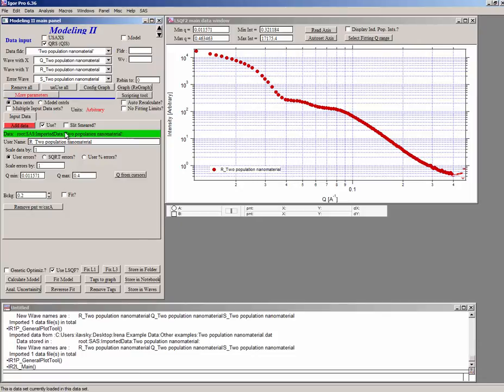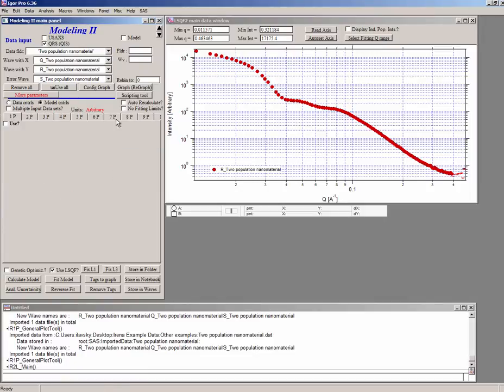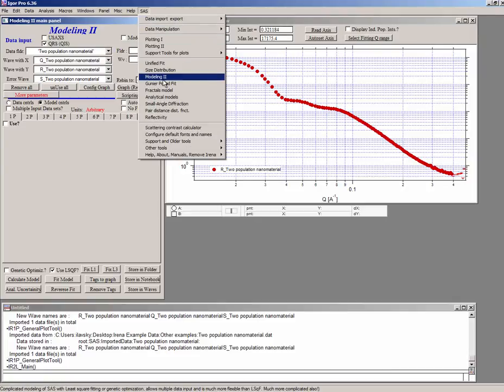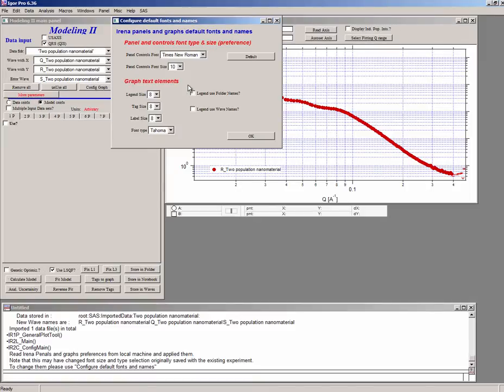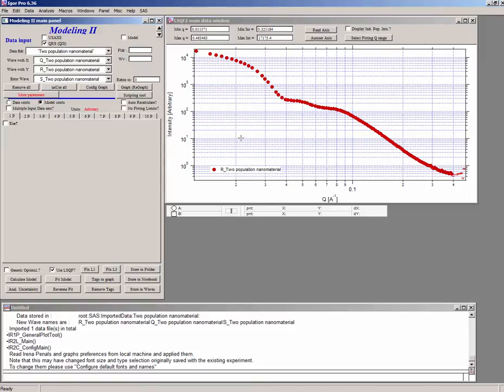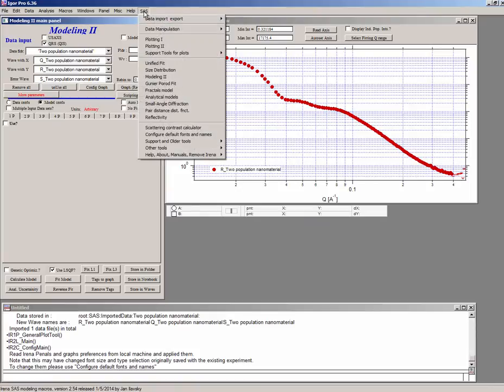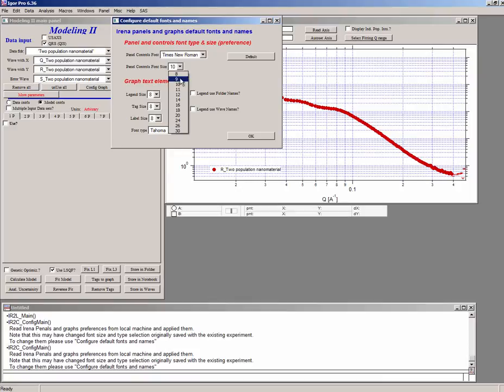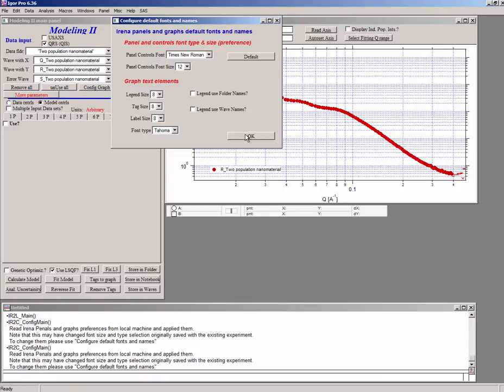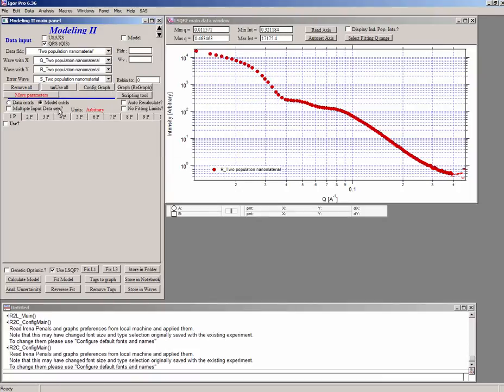Now we can go and build a model. So we're going to go and click on the model controls. Here's 10 populations. And if you don't see all of them, you can do the same thing. Configure default fonts and make the font smaller. If we make it smaller, you now see all 10 tabs. But for you to see it better, I'm going to make it a little bit larger. And I'm going to go back to 12 so it's easier to read on your screens. So there would be 10 possible populations. And each population can be a size distribution of particles. It can be a unified fit level or it can be a diffraction peak.